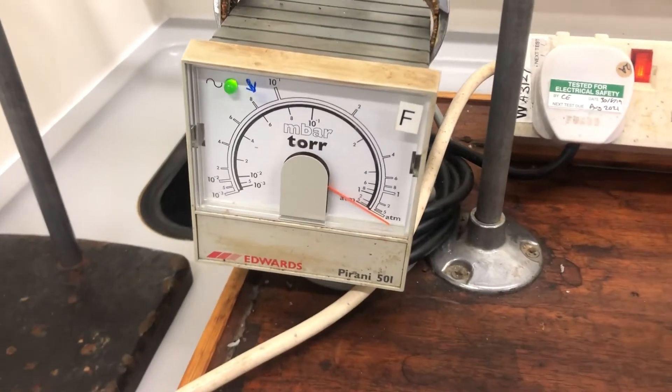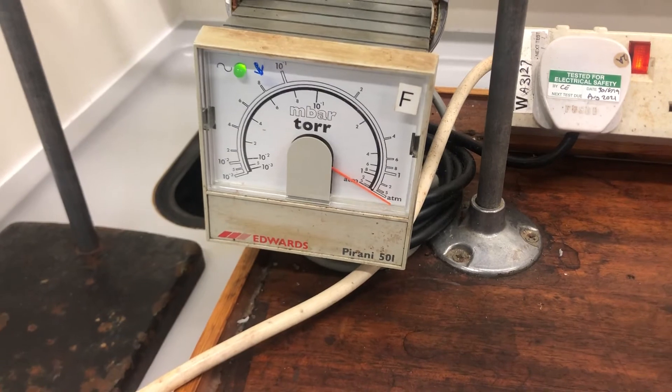So somewhere around 10 to the minus 1 millibar is really what we look for when we want to work at low pressures.